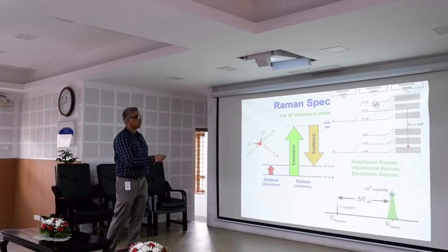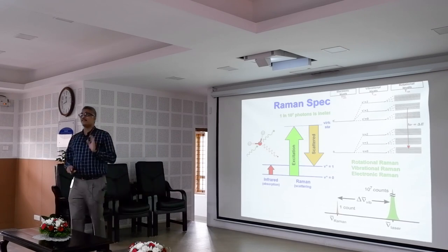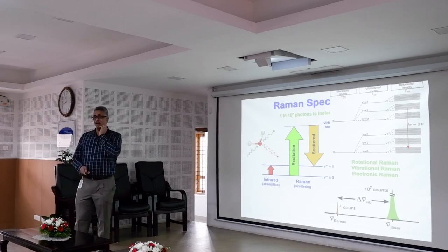Or this. I will be only talking about vibrational Raman in today's talk. Okay, so there are many Raman which can be done, but we do not have to worry about it.